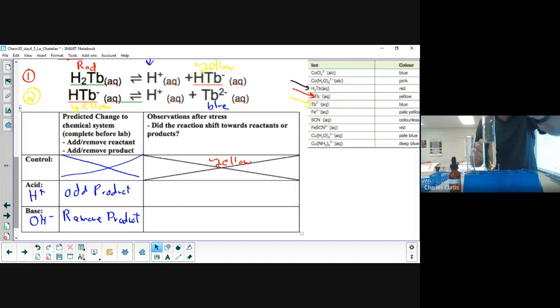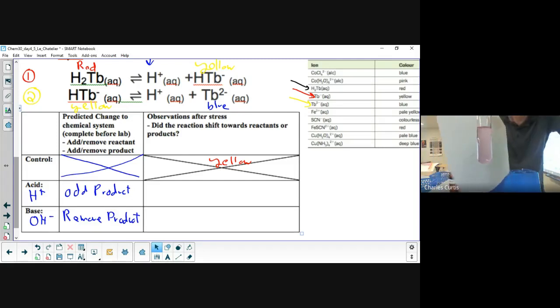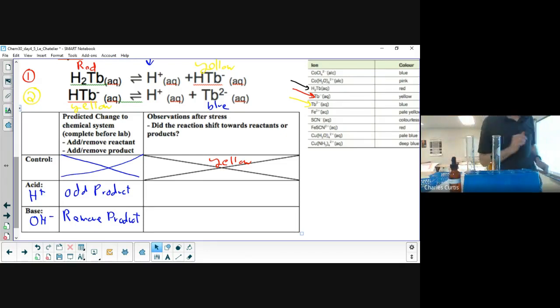So there's our equilibrium mixture. Looks a little pinkish on the top. Let's add more. And it has definitely turned a pink color. So our observation is we're seeing a pink. We don't have any pinks here, but that pink is probably the early sign of red. If I kept adding more, the pink would get darker and turn into a red.